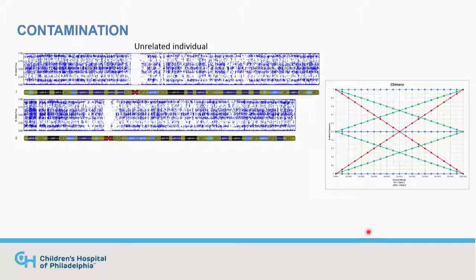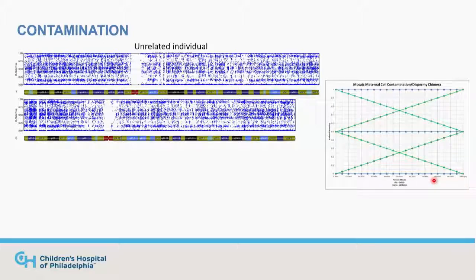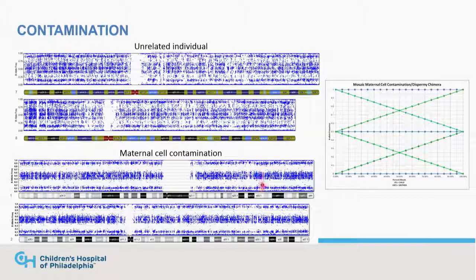With contamination from a random individual, we see all these different bands across every chromosome across the entire genome. For maternal cell contamination, it's less complex because we always share one haplotype with our mother, so those red bands — where one is AA and the other is BB — go away, because a child should always have at least one shared haplotype unless there's uniparental disomy. The example at a similar percent shows this one band is no longer present.